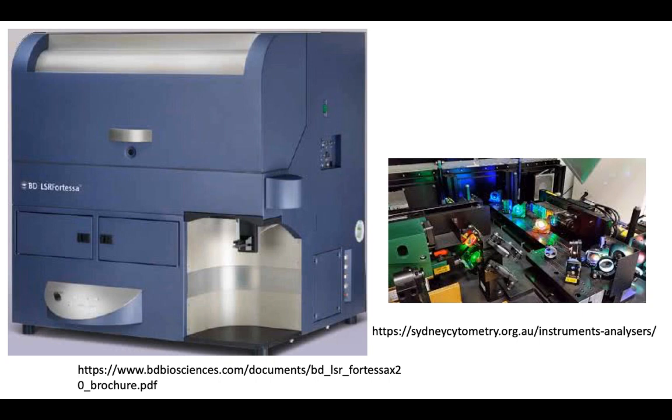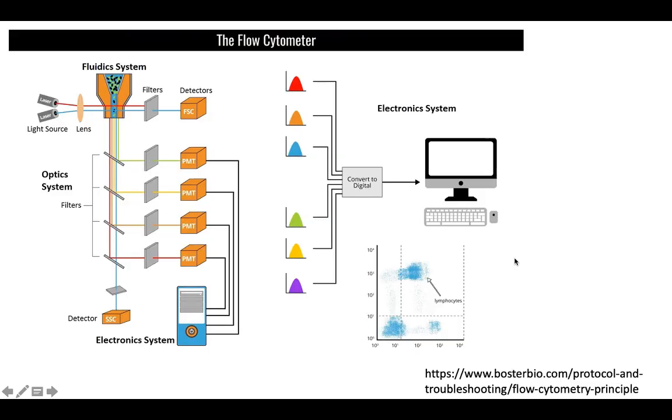This is how a flow cytometer looks. This is the one that I use in my lab, and it's a BD LSR Fortessa. There are many, and these are very complicated machines, but they are some of the most beautiful applications of the field of optics. It's again a reminder of how physics is the mother of all sciences. So all these beautiful images and beautiful lights here right in front of me.